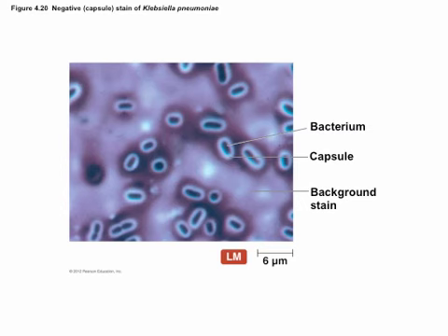But capsules are not positively and not negatively charged. I mean, they're usually neutrally charged. So acidic dyes don't stick to them. Basic dyes don't stick to them. In fact, dyes in general don't stick to them, which can make them difficult to view directly. But here, you can use the fact that dyes don't stick to the capsule to make it so that you can see the dye sticks to everything else, except the capsule. So you can see the capsule by where the absence of the dye is.